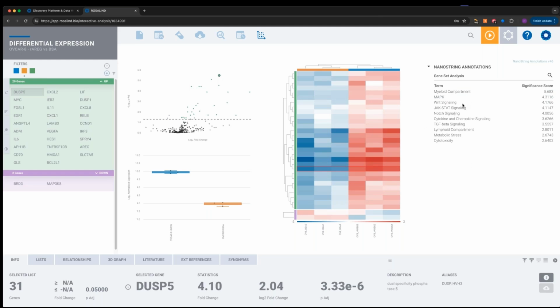What you'll see by default when you come to an nCounter experiment are all of our NanoString GSA scores. These are those gene set analysis scores. This happens to be the global score. We can look at the directed scores as well in a different place, and I'll show you that. But by default, the first time you come to this page, you're going to see all of these GSA scores for your NanoString defined pathways. These are annotated specifically, in this case, for the IO360 panel. So when you come here, you will see a list of pathways and their significance scores.